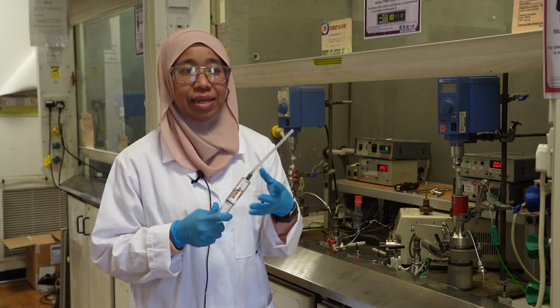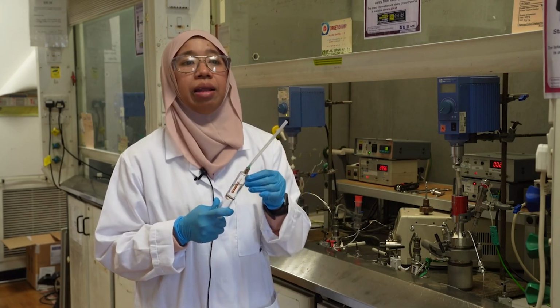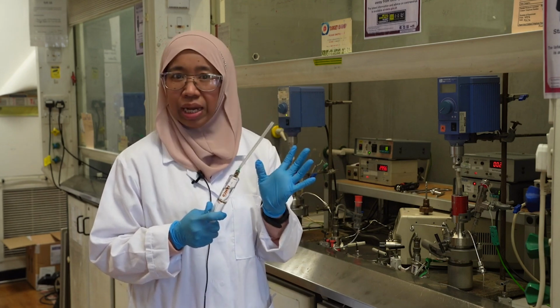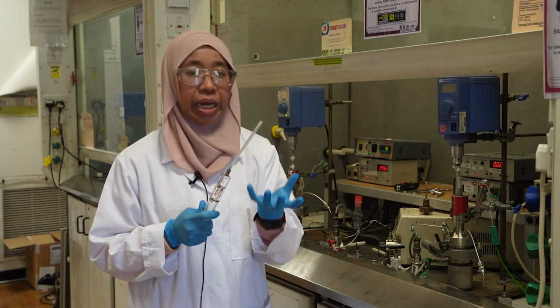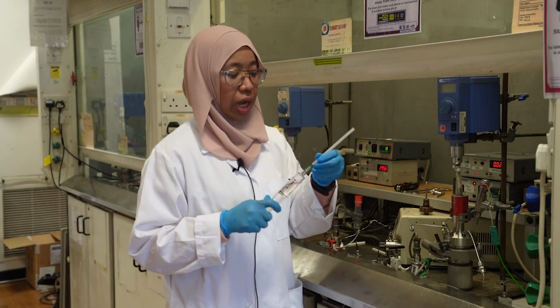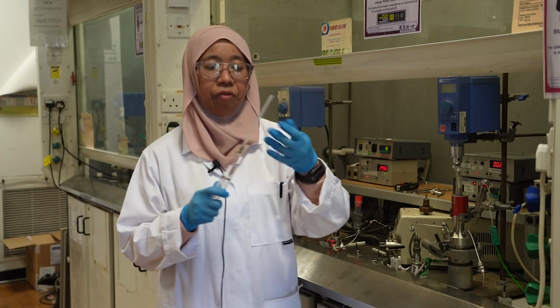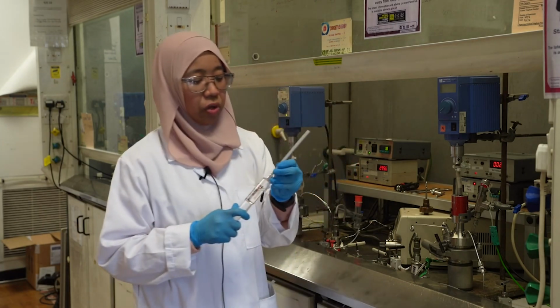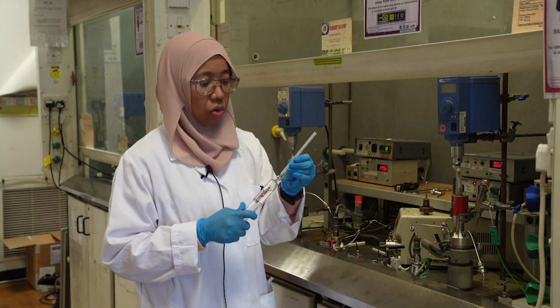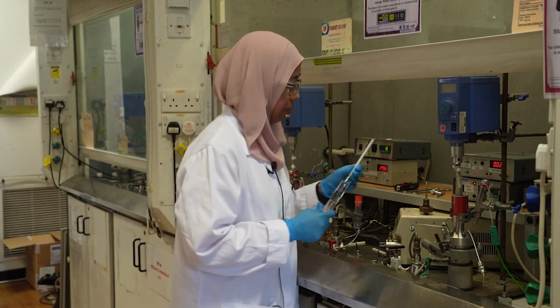So we need to degas the mixture. I put it in the fume cupboard and then degas with argon gas for about 20 to 30 minutes, and then leave it in the ice bucket, and it's ready now. I'm using the syringe with a long needle here. I'll get it from the fume cupboard and bring it here. As a safety measure, you have to make sure the lid is always on. So yeah, it's ready now.